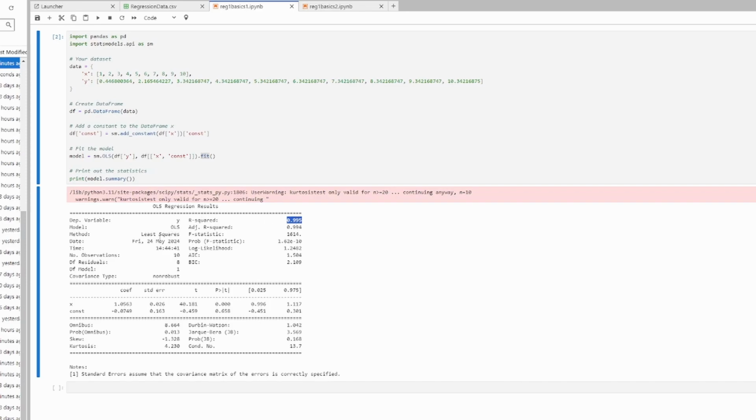So based on the y variables, number of observations, the various calculations, it'd be interesting, I think this is the slope here. And so this is our B-intercept potentially. So I'd have to go in and make sure about this. But there's more data that comes out of it that I am actually not familiar with. So I'd have to go through, put this back into ChatGPT and try to ask questions about it. But I believe these coefficients are the data that we're trying to get, potentially.